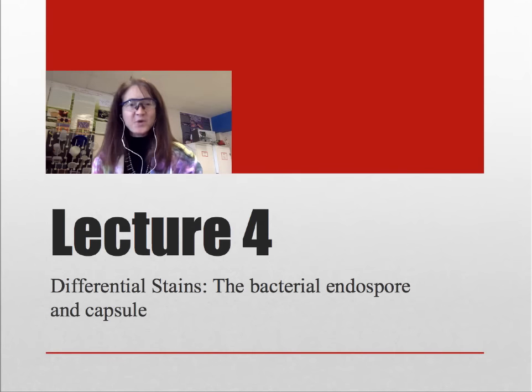Welcome back. I hope you are ready for some more differential action because we are going to be turning our attention away from the gram stain and the acid-fast stain and looking at two different differential stains, the bacterial endospore stain and the capsule stain.